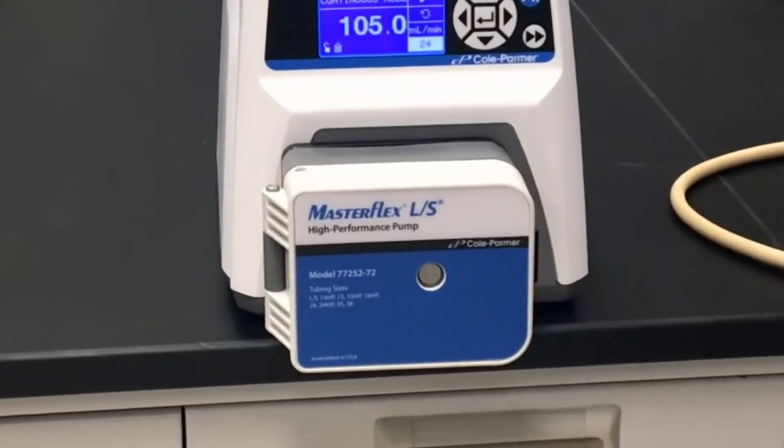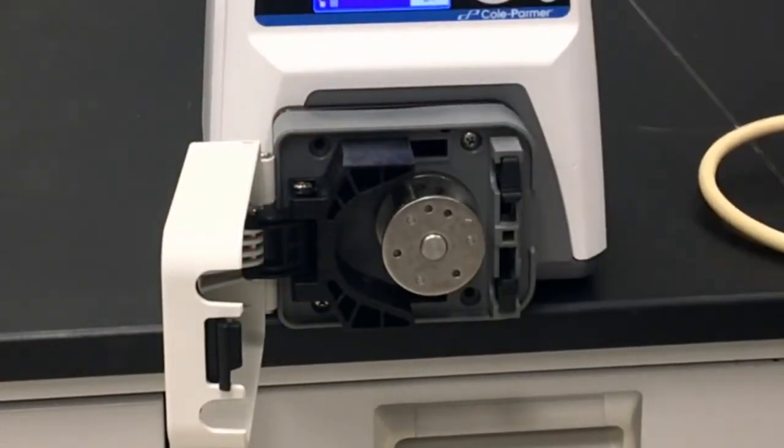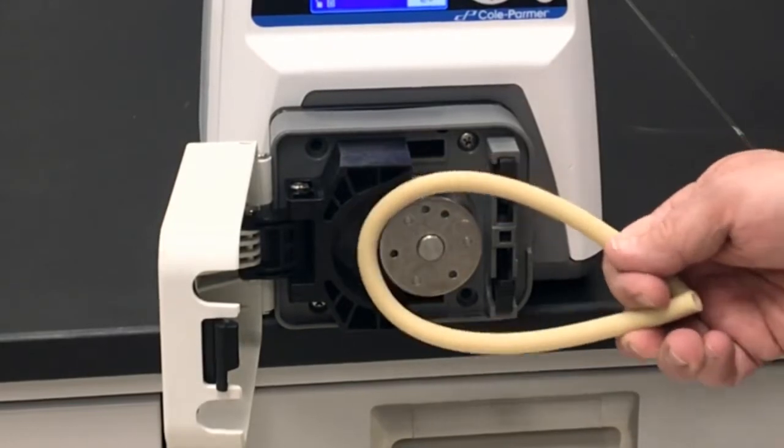Open the pump head door to slide the occlusion bed away from the rotor. Wrap the tubing around the rotor, being sure to follow the natural curve of the tube.